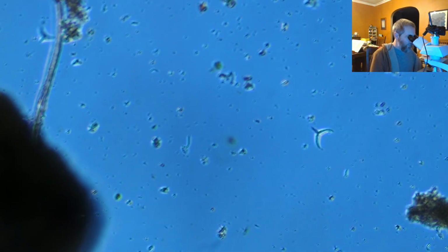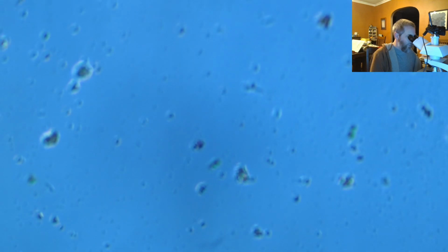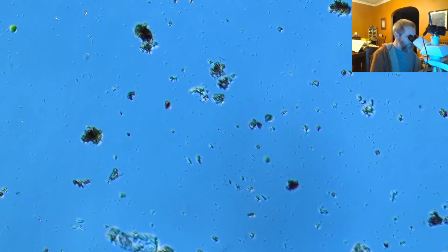In some cases, the water bears will molt, and then they'll just leave the eggs in the molt behind. And so that might be what was going on with that other water bear that we saw, because it looked like it had maybe eggs in the back end of it. And that's how they handle that. A lot of them will just molt, and then the eggs will stay in the molt as a place that's safe, or somewhat safe, for the eggs to be, and they'll just leave them in there, and then move on. So those eggs will just then hatch on their own.